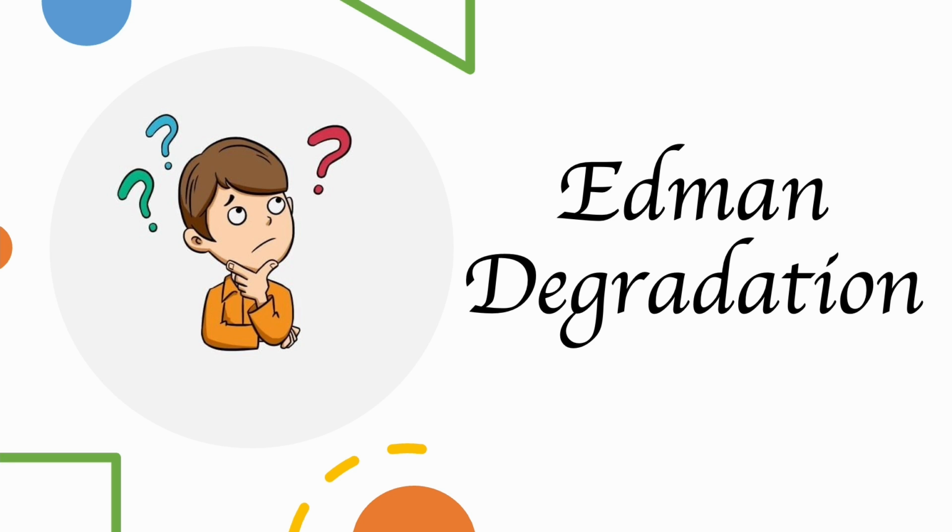Hello everyone. In today's video, let's talk about the Edman degradation.